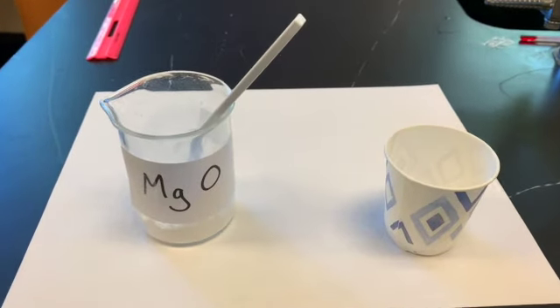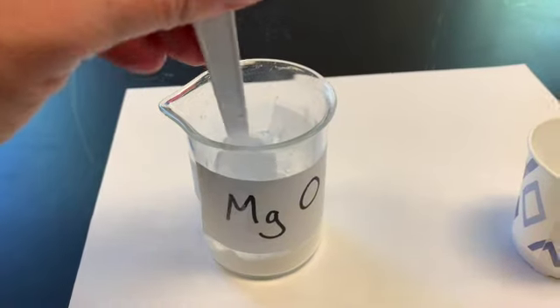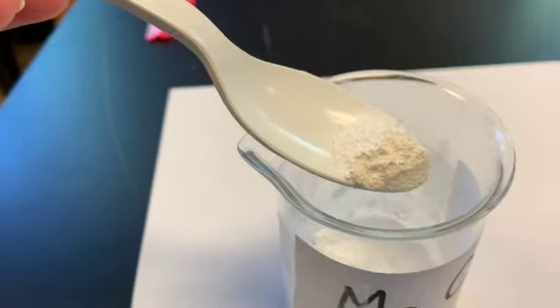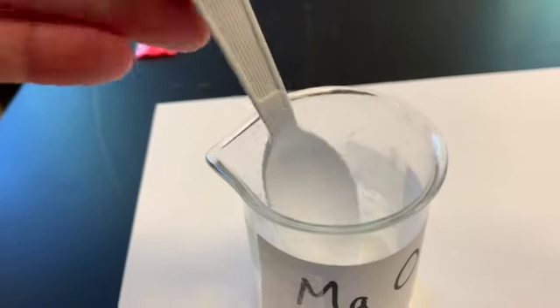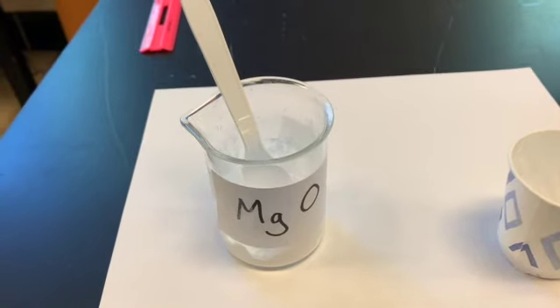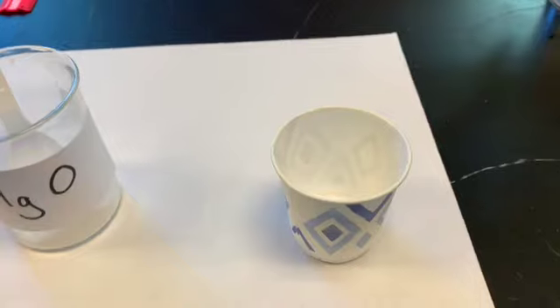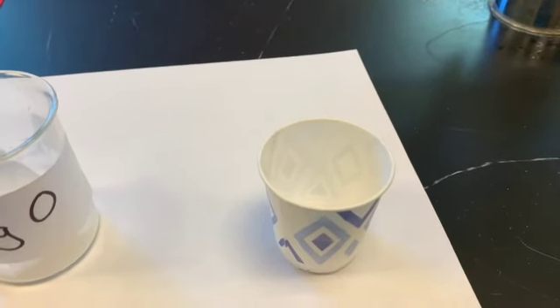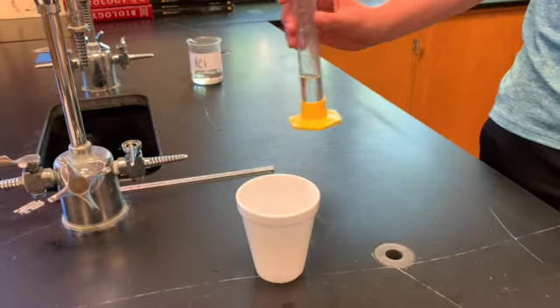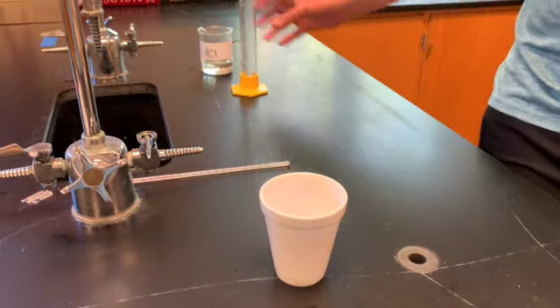All right, so we are ready for reaction number 2. In reaction number 2, we're going to take magnesium oxide. And remember, magnesium oxide is that white powder we produced when we burned that magnesium. So we're going to start out with magnesium oxide, and we're going to react that with hydrochloric acid. We've already massed out in this Dixie cup exactly 1.00 grams of magnesium oxide. Maurice is going to pour in the 30 milliliters of hydrochloric acid. And we're going to find the initial temperature of that.